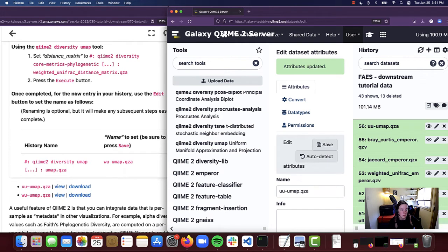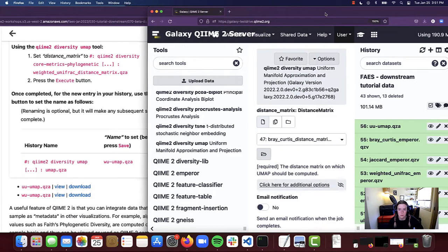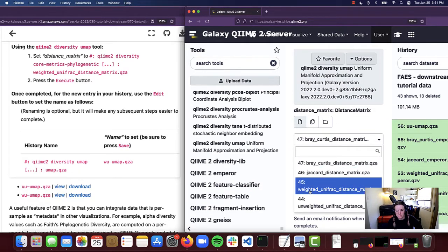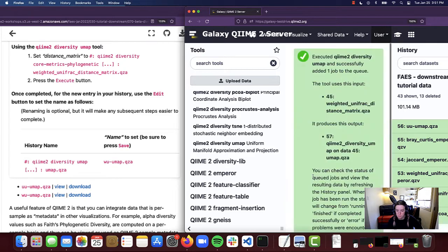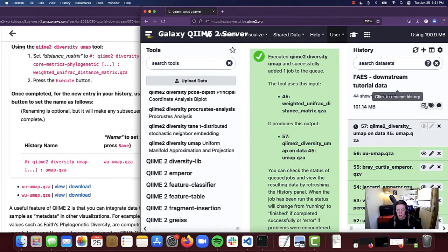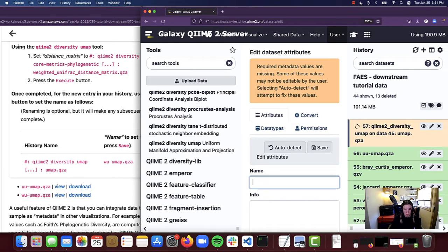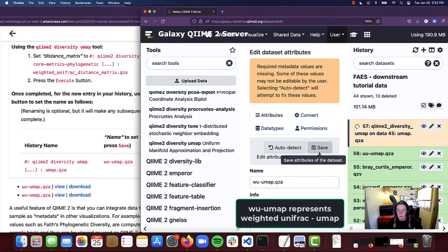Next we are going to do the same thing for our weighted UniFrac distance matrix. I'm going to click on the QIIME 2 Diversity UMAP one more time. This time for the distance matrix I am going to select the weighted UniFrac distance matrix.qza, and then select Execute. Then I'm going to rename this by clicking on Edit Attributes and under the name field type in WU-UMAP.qza, then click Save.